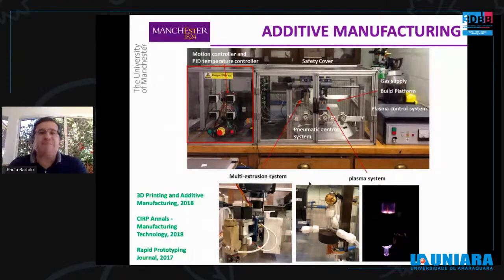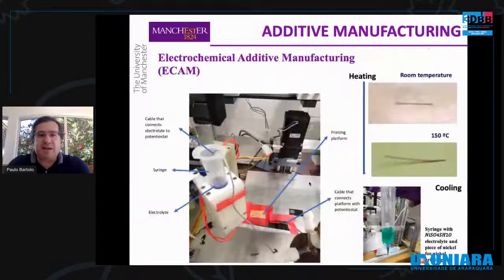And this is the ideal machine to create functional graded structures. And we published a couple of papers describing the equipment and also some applications using HIT.